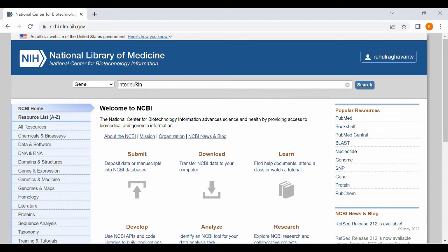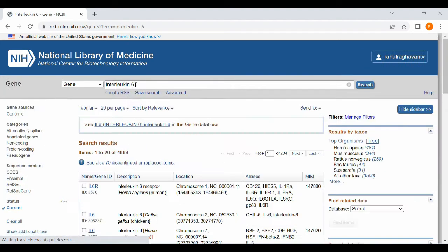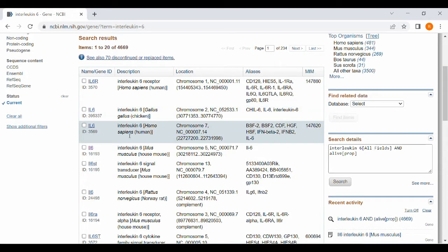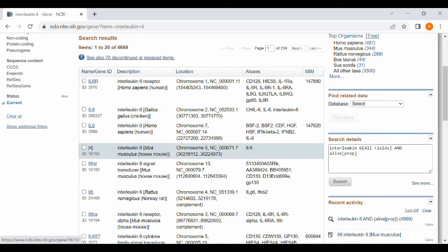For an example, I am typing here interleukin-6 and give a search. It will give a lot of options including interleukin-6 receptor. So here I am clicking on interleukin-6 mouse.